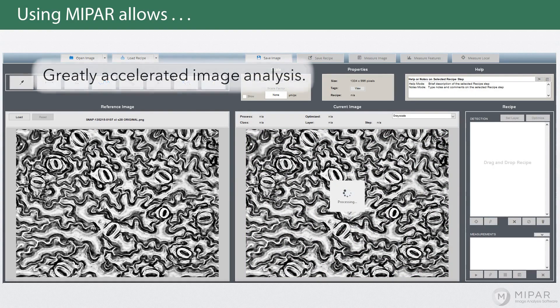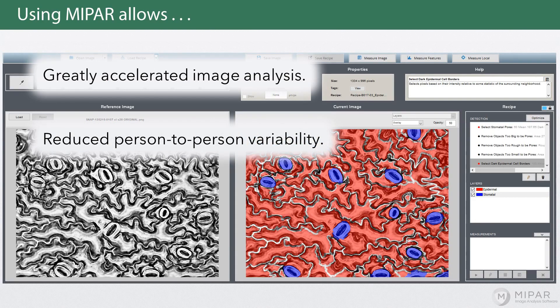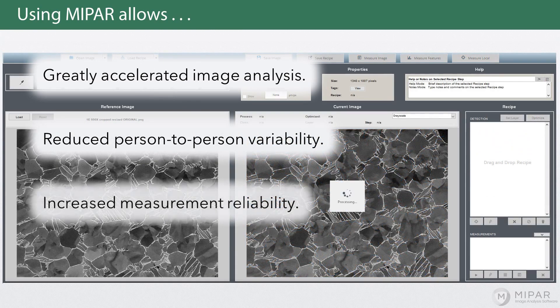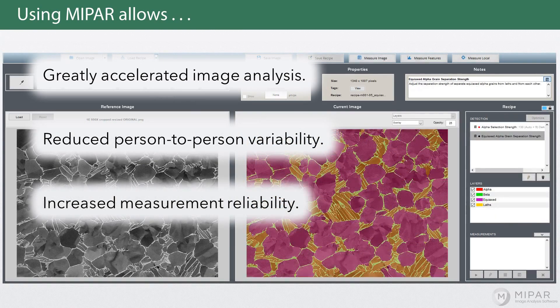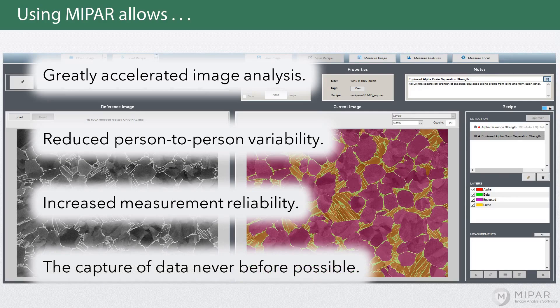This will greatly accelerate your image analysis process, reduce person-to-person variability, increase measurement reliability, and enable the capture of data never before possible.